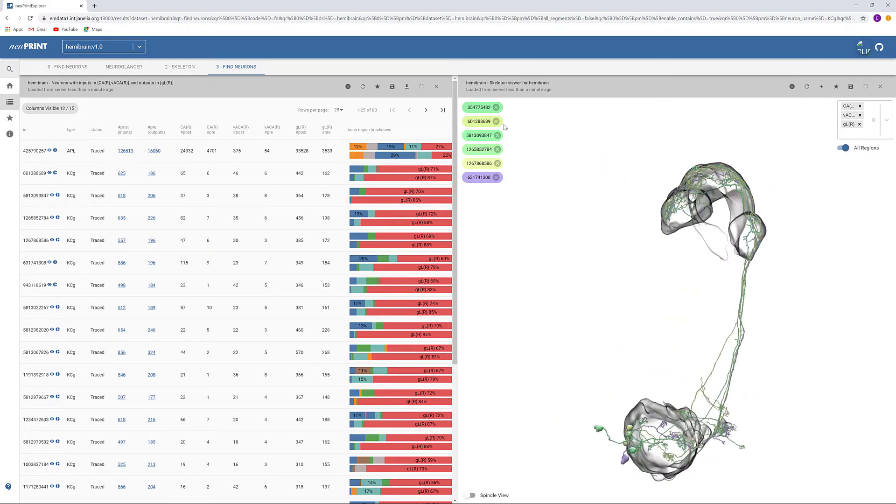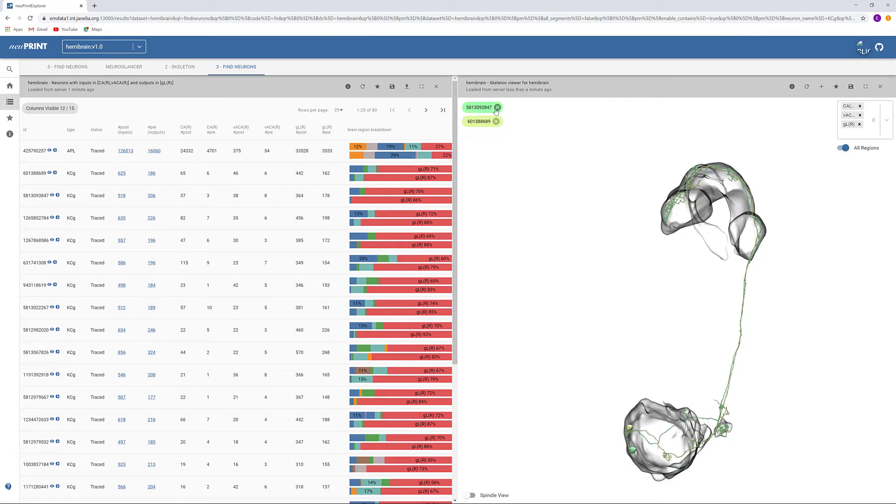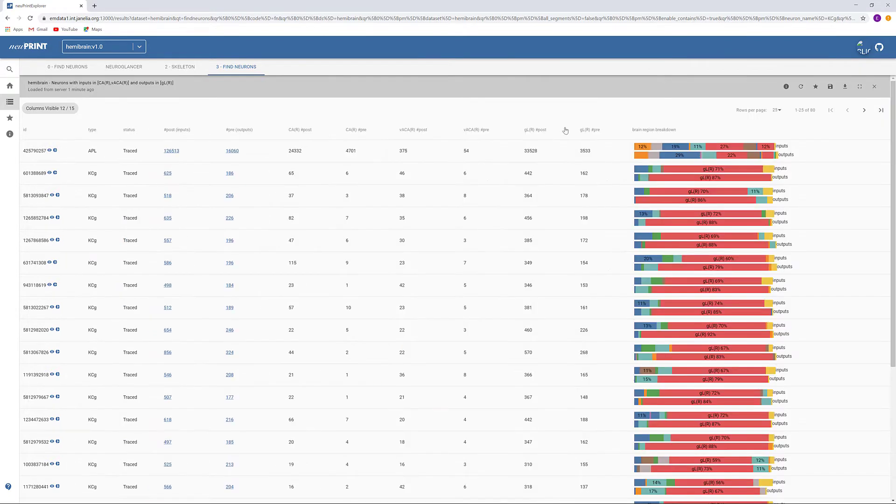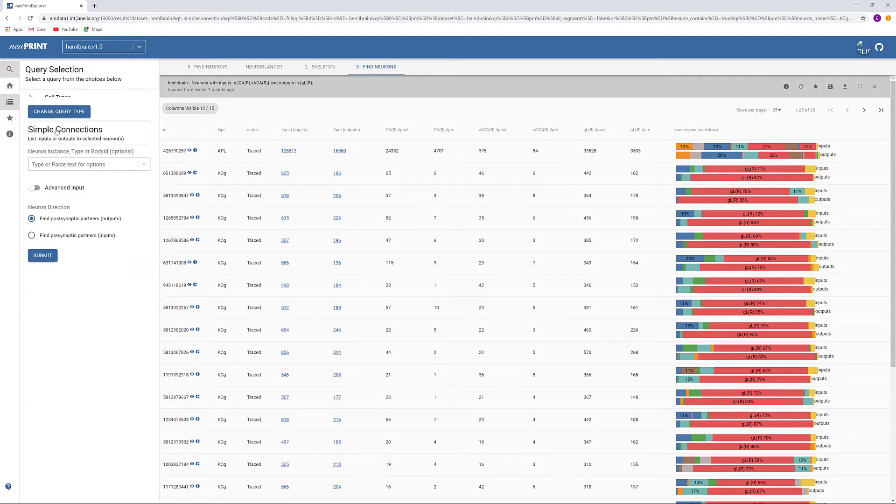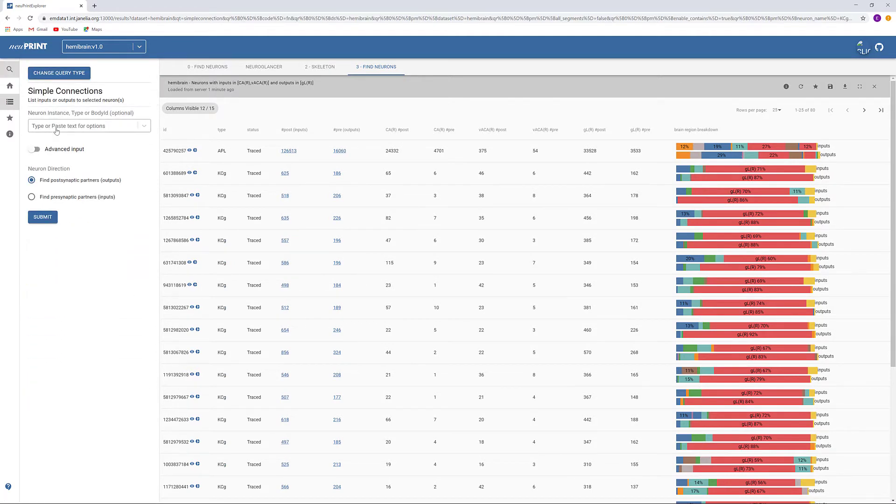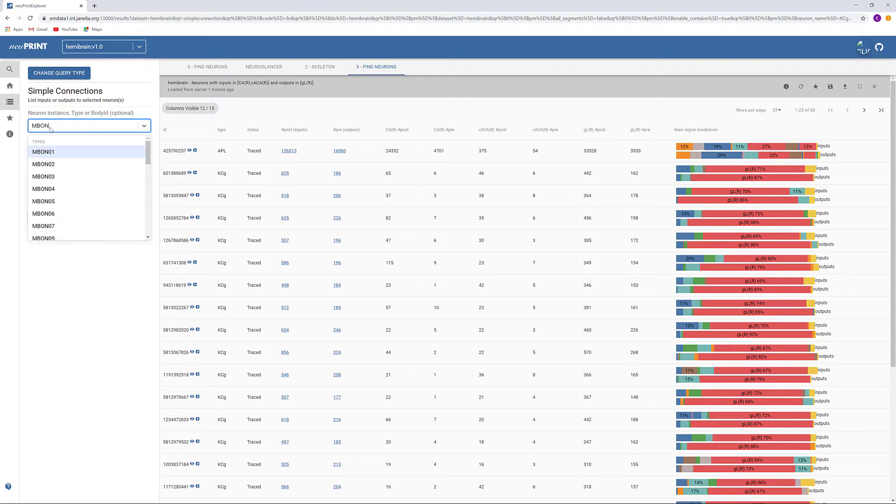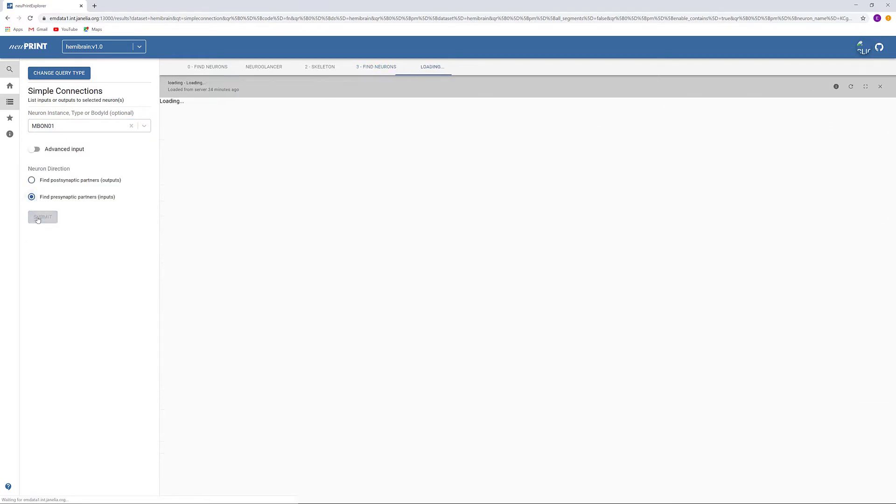Another way we can find a neuron type is by searching for connections on a neuron that we know it synapses with. One neuron that we know synapses with Gamma Kenyon cells is M-Bond number 1. We can use the simple connections query to find inputs to this neuron.